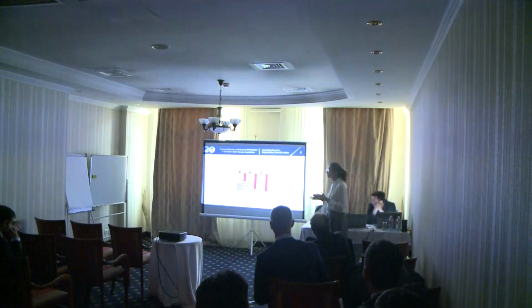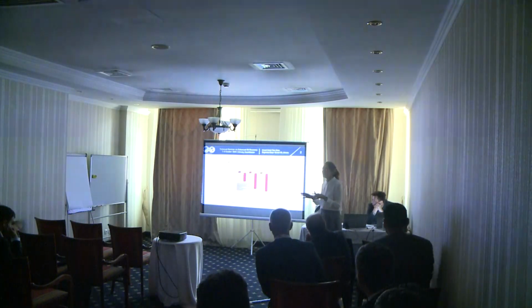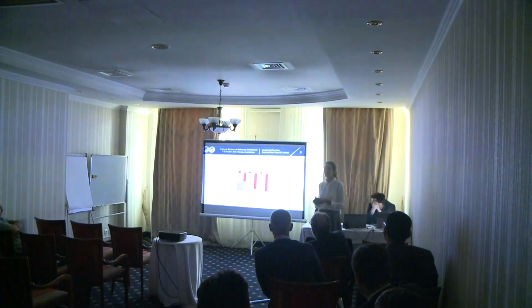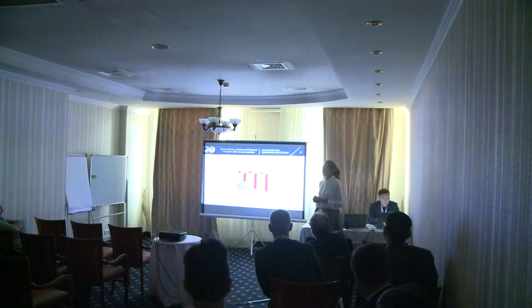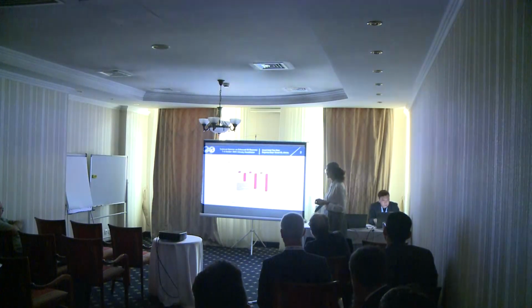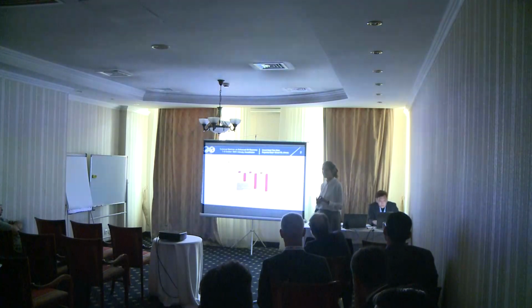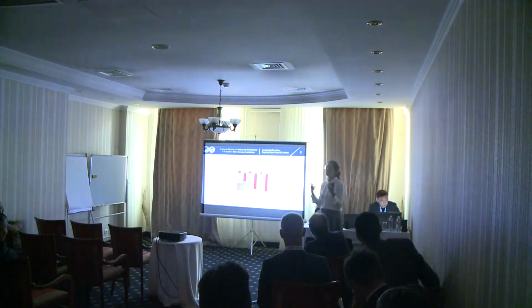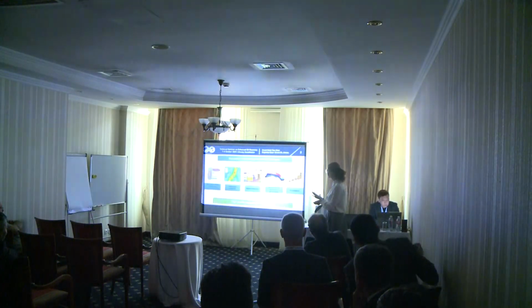So my presentation will be focused on just one question. And this question is what and how needs to be measured when we talk about polymers. And this is just one graph presenting the effect of oxygen and iron on polymer solution stability. And we know when we have these two factors, both oxygen and iron in the solution, it destroys our polymer solution very much. But let's start from the beginning.